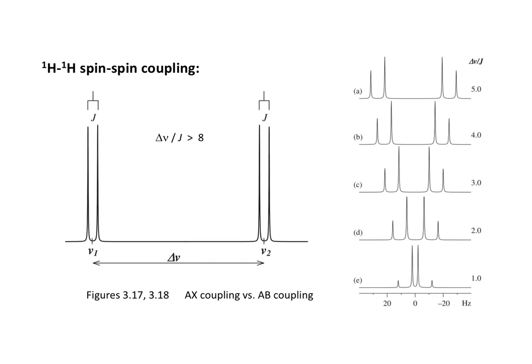In introductory spectroscopy courses, instructors and textbooks are generally very careful to show proton-proton spin-spin coupling patterns that are first order. This requires that the difference in frequencies for two peaks is at least 8 times greater than the coupling constant for an individual peak.